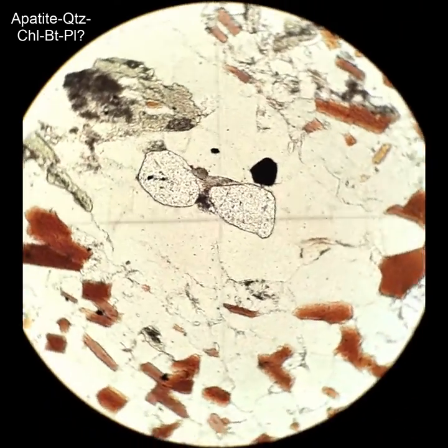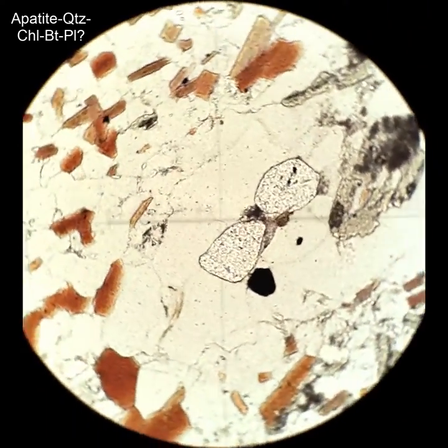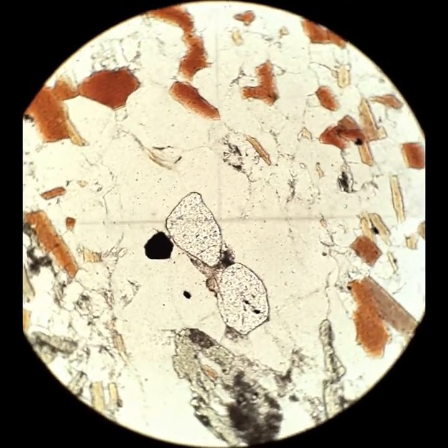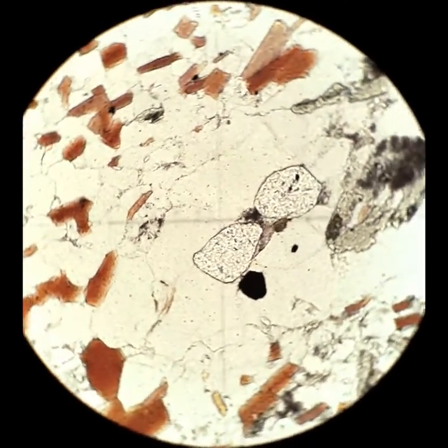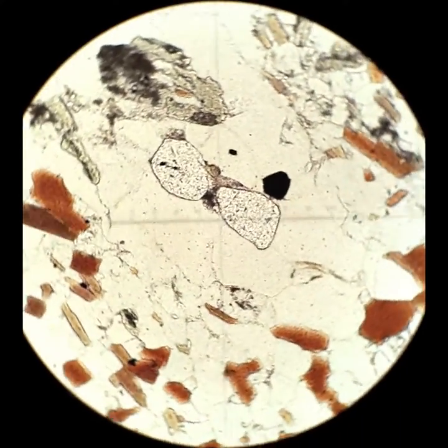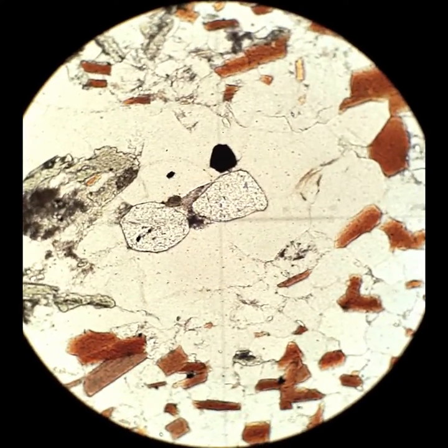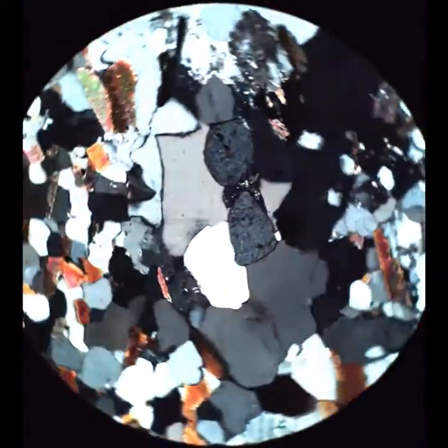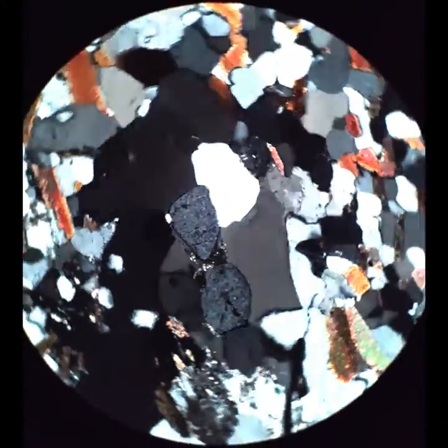Here are a couple of apatite grains near the center of the field of view. They show this pretty high relief, and that's what really makes them stick out when you're looking through a thin section. In cross-polars, these are actually particularly gray. That's about as bright as they ever get.